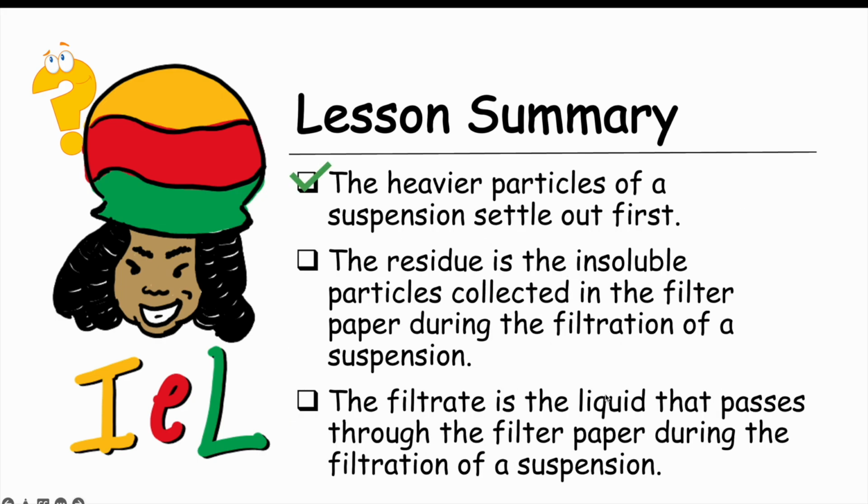The heavier particles of a suspension always settle out first. The residue is the insoluble particles collected in the filter paper during the filtration of a suspension. The filtrate is the liquid that passes through the filter paper during filtration of a suspension.